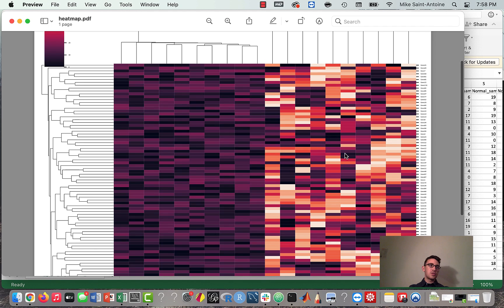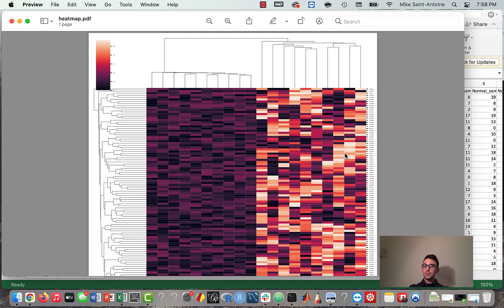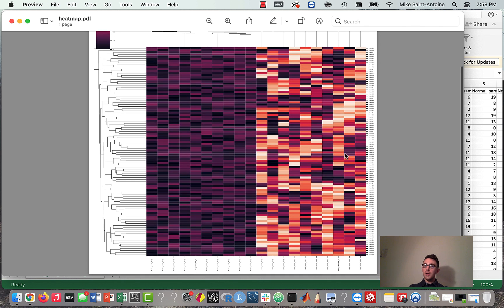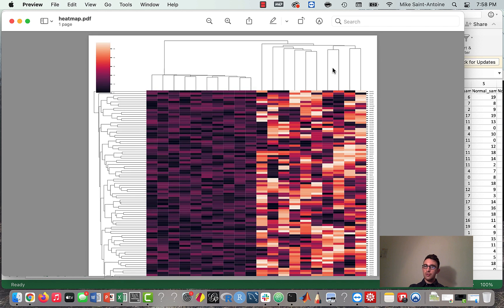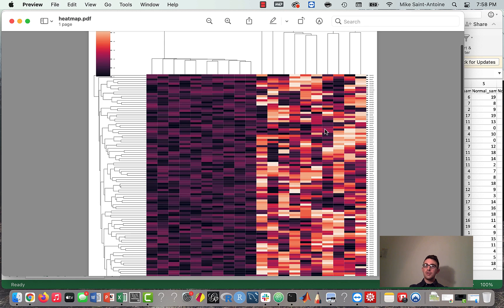I kind of generated this fake data just to have something to work with for example. The tumor samples are all clustered together, and then the normal samples are not. We can think of these genes as possibly being like biomarkers or something, because they have higher expression in the tumor cells than normal cells.